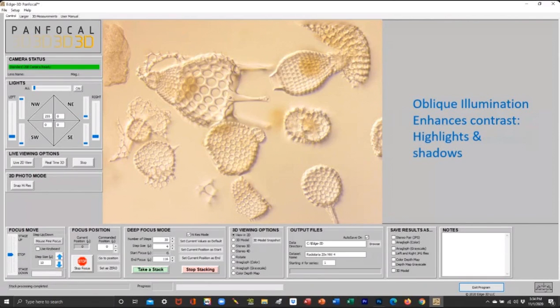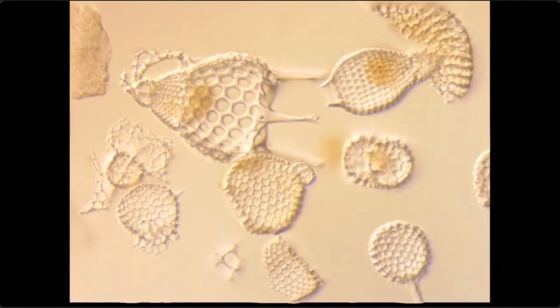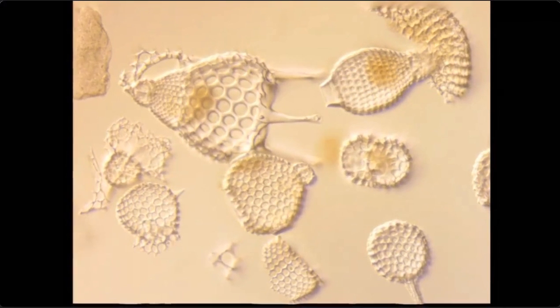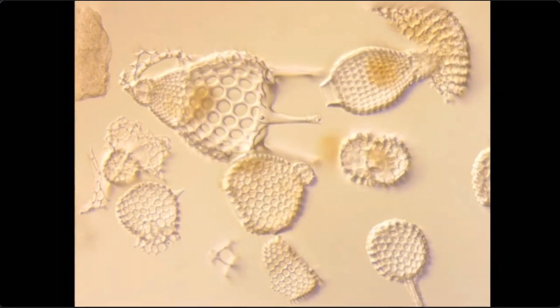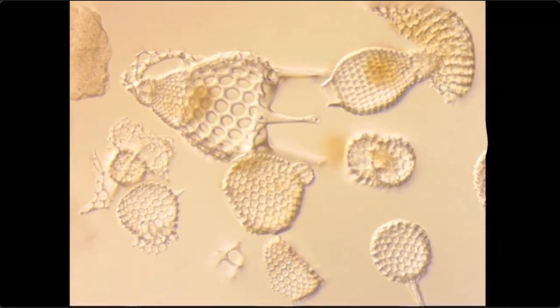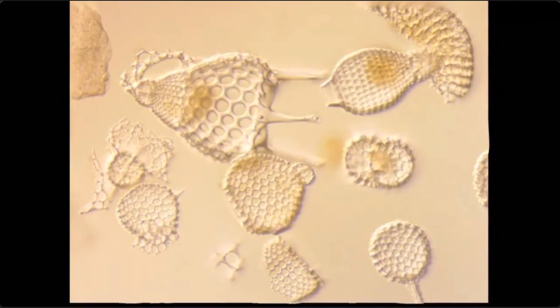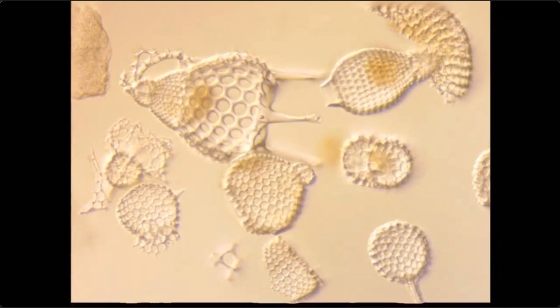Now, if you click where it says rotate, that's what you get. It makes a little rotational movie loop. So now, not only do you get the great resolution and the great depth of field and all the stacking, but you get a 3D perception of it that you can show to people by posting it on a website, or on links on the internet.